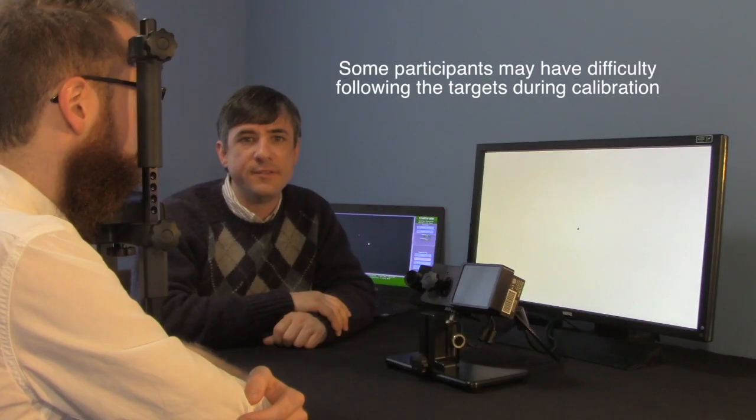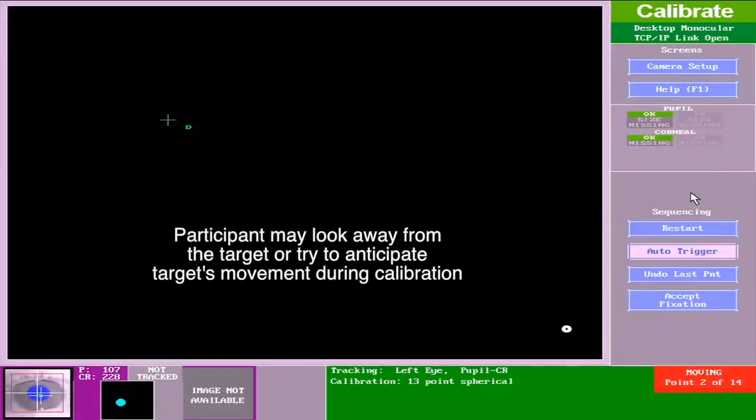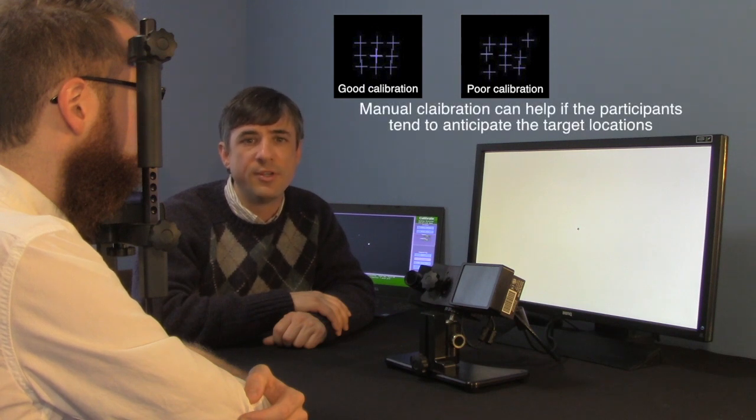Some participants may have difficulty following the targets during calibration. For instance, they may look away from the target before the tracker registers their fixation, or they may have difficulty making fixations in general. In these cases, the calibration crosshairs will appear irregular instead of in a nicely shaped grid. It can help to enable manual calibration, which allows the experimenter to control the pacing of the calibration.